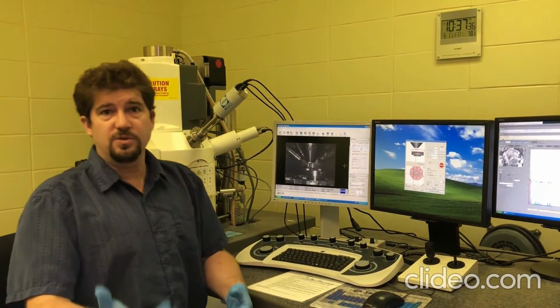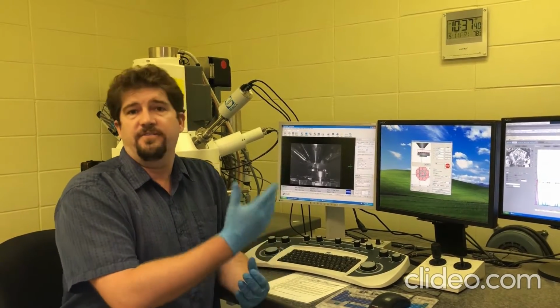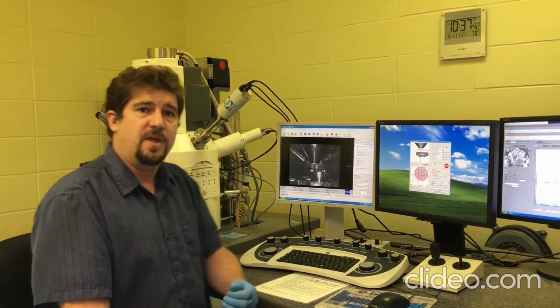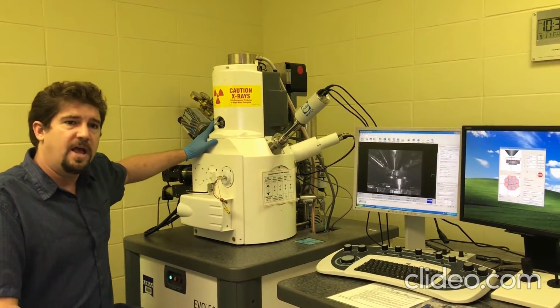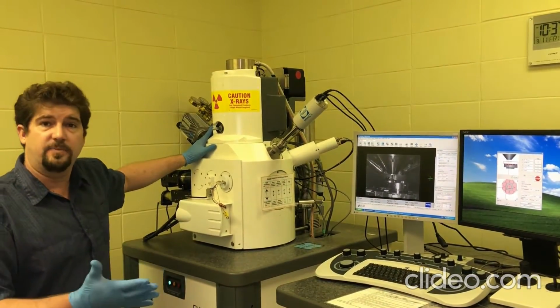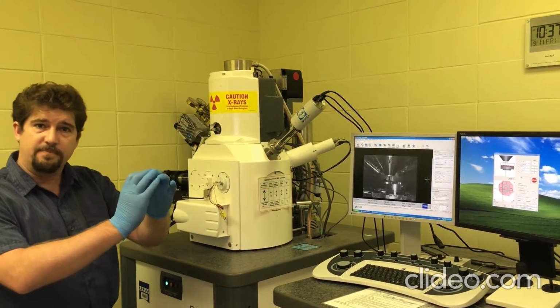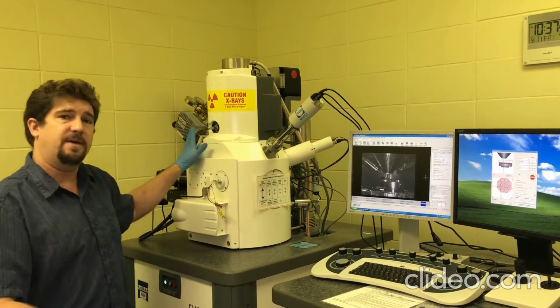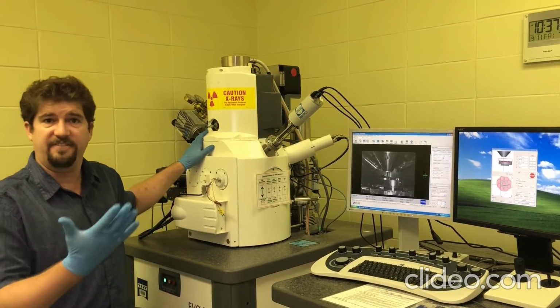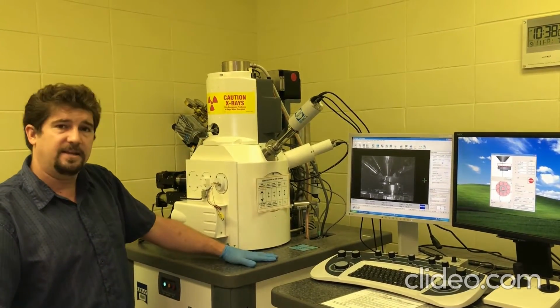And we're all really used to using electrons because we use them every day when we turn on any of our electrical devices, okay? But this machine behind me is called a scanning electron microscope. And it uses electrons in a little bit different way. What it does is it makes the electrons into a beam, kind of like the beam of a flashlight, except for whatever I put into my beam of electrons, I'm able to magnify it and see it up really close, as opposed to just making it light.